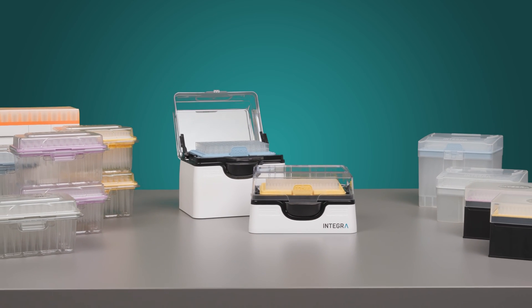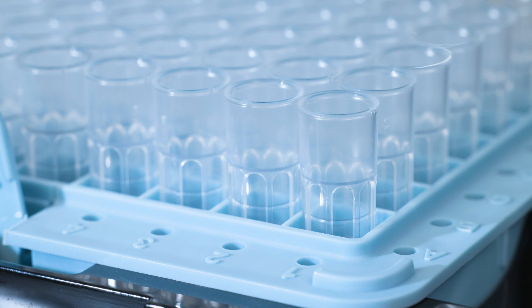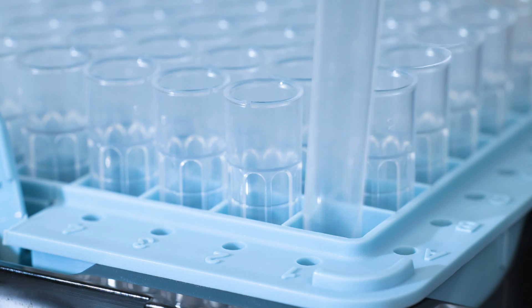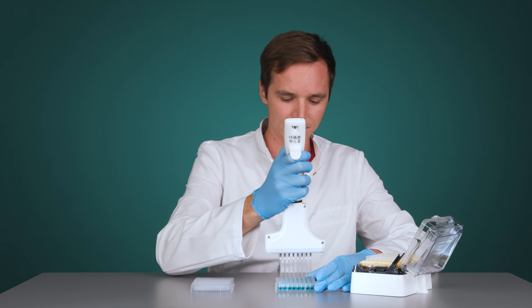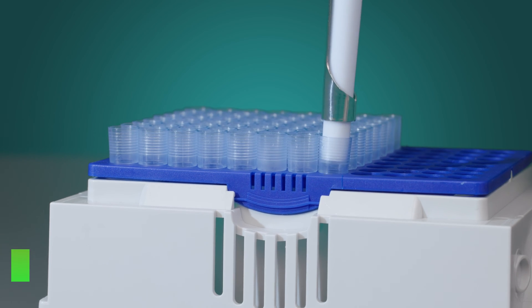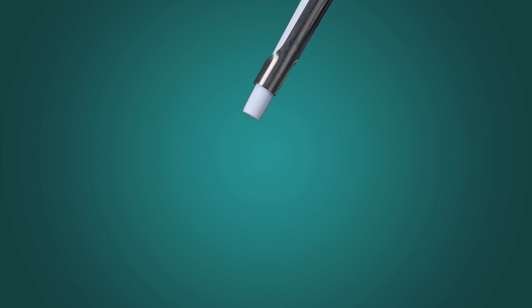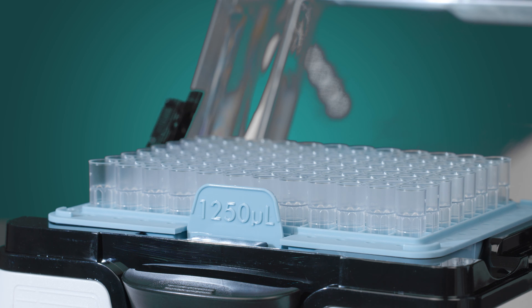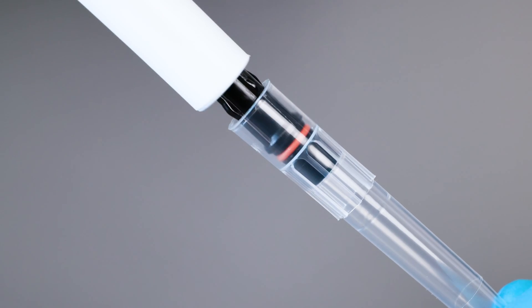Our grip tips don't only ensure that your tips stay in place, but also offer a handful of other advantages. We designed grip tips to slip onto the pipette with minimal force instead of hammering. A technician can pick up the tip with 0.5 kilograms of force — that's less than picking up a large cup of coffee. That 0.5 kilograms sounds trivial until it is multiplied by the hammering effect, and as a result the tip ejection force is also multiplied. There is no such multiplication of force with grip tips. They are easy to load and eject, hence contributing significantly to the reduction of repetitive strain injury.